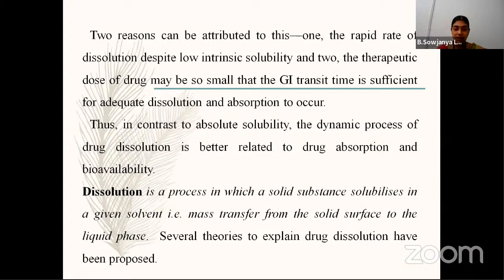Simply, mass transfer from the solid surface to the liquid phase is called dissolution. Disintegration is simply the breakdown of a tablet into smaller particles like granules. Dissolution is mass transfer from the solid surface to the liquid phase.